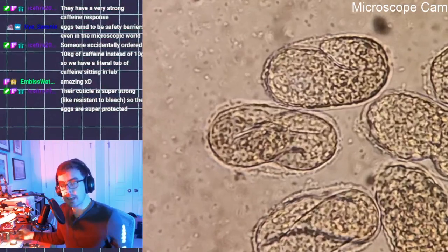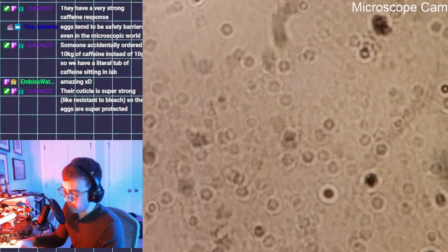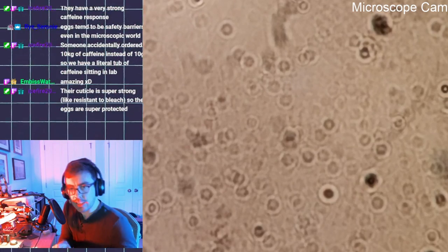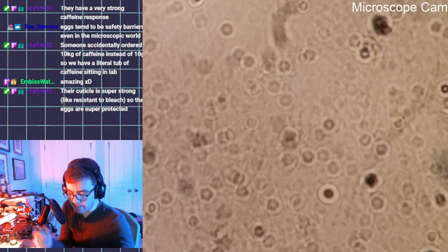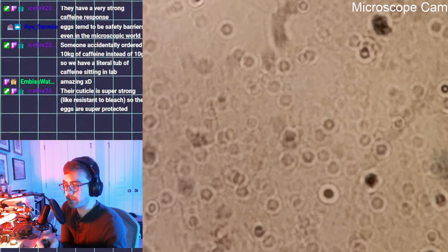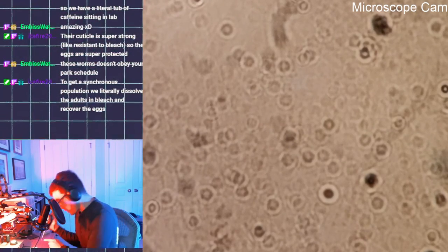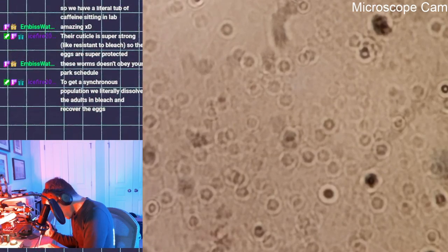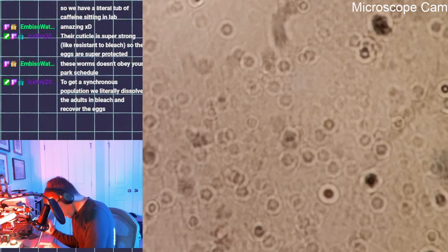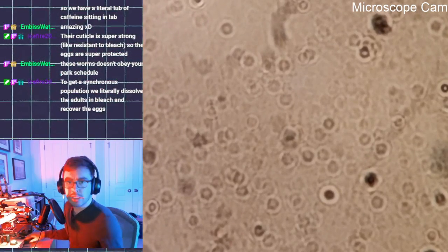Okay. I am actually going to take these off because I do worry about them drying out. So I'm taking them off. I'm going to add a little water to them and just let them sit to the side, and we'll look at some other things, but we can always come back. So remind me if you'd like to see more of the C. elegans. Yeah, okay. So they're off to the side, so we will check on them later.